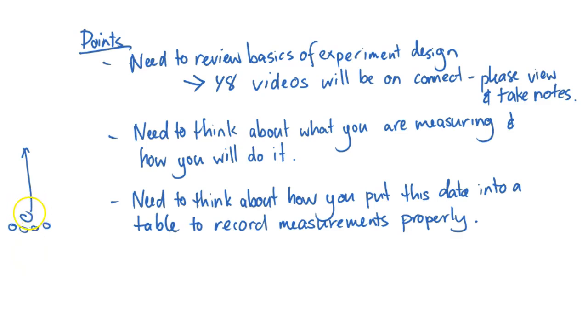But what if that leaf disc is one that's got more chloroplasts than everything else, and it's not a good measure of the average part of a leaf? If you just measure one, then you're really not getting the best measurement. If any of these leaves were slightly damaged during the process of cutting them out, you may have damaged the cells so that they can't photosynthesize. So not all of them may float. So you don't want to have to wait until all of them float, because some of them may not. So what we said in the end was, take the first 5 leaves, because I said 5 to 10 in your little tubes, and wait for 5 of them to float, and time how long that takes.